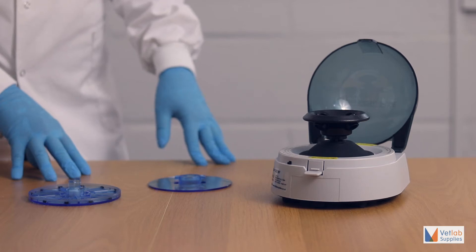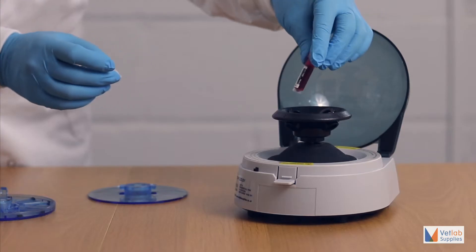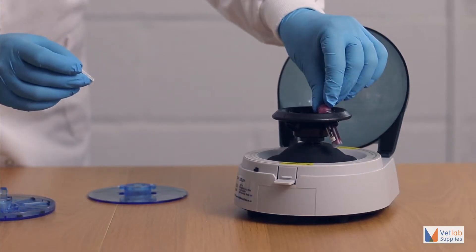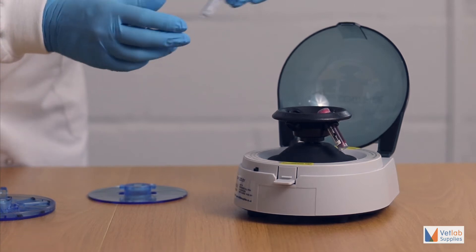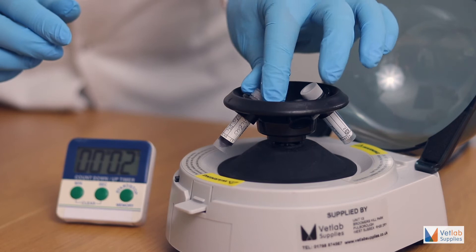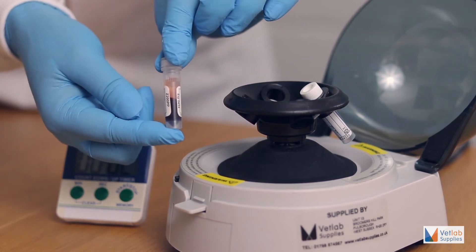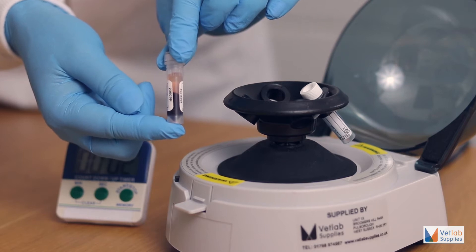The Vetspin Micro is a mini benchtop centrifuge designed for spinning small volumes of biological fluids. Our Vetspin Micros are ideal for separating serum or plasma from blood cells in whole blood samples. They perform micro hematocrit estimations on anticoagulated blood samples and prepare urine for sediment examinations.